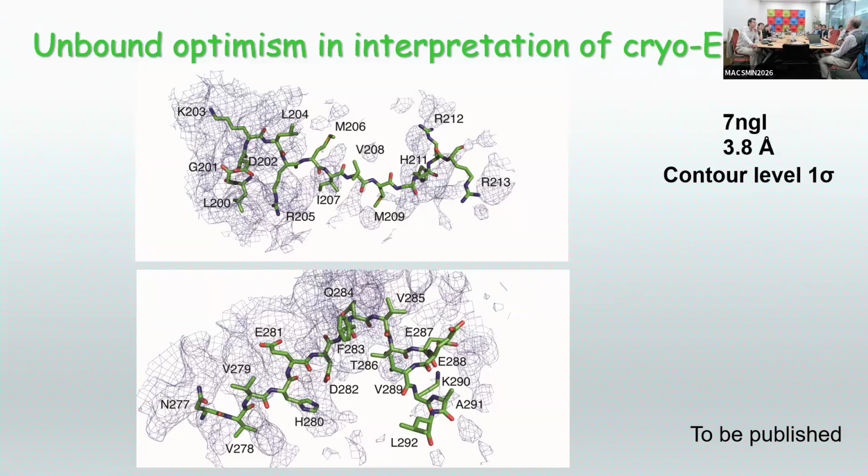On the other hand, there are some particular cases, and the ribosome is the best example, where cryo-EM wins hands down over crystallography, because there are about 600 crystal structures of ribosomes and 1,300 cryo-EM structures of ribosomes, and the ribosome structures done by cryo-EM are at higher resolution, the best structures, because they went to right now about 1.5 angstrom, and the best crystal structure is at around 2 angstrom. It's still hard to crystallize ribosomes, and cryo-EM is a perfect technique for looking at molecules which are big and reasonably rigid. So for ribosomes, cryo-EM clearly wins hands down.